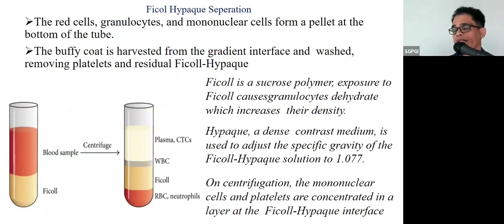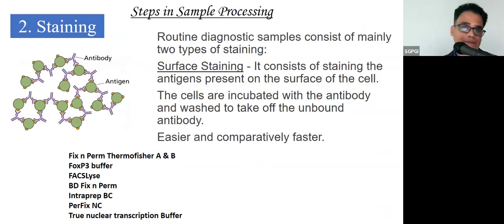after any wash. When I say wash, you have to add PBS and centrifuge it for either 2 or 3 minutes, depending on the time. That has to be set according to the lab. You can refer again. For a 5 ml tube, we use a 2 minute wash, spinning at 540 G. For tubes like 15 ml or 50 ml, it should be 4 to 5 minutes. Otherwise you will lose the cells.